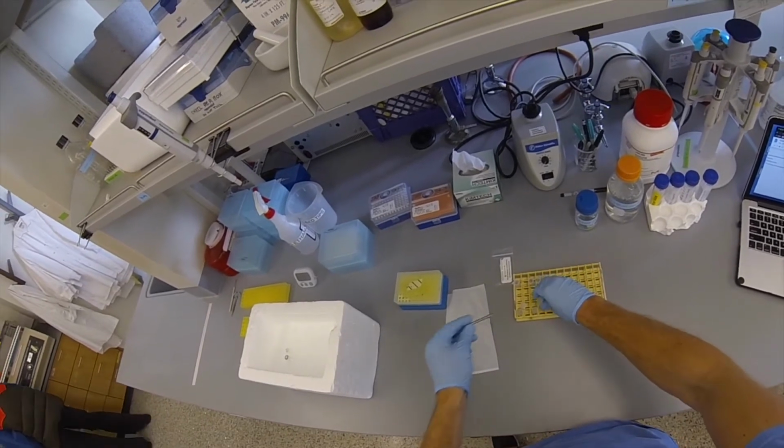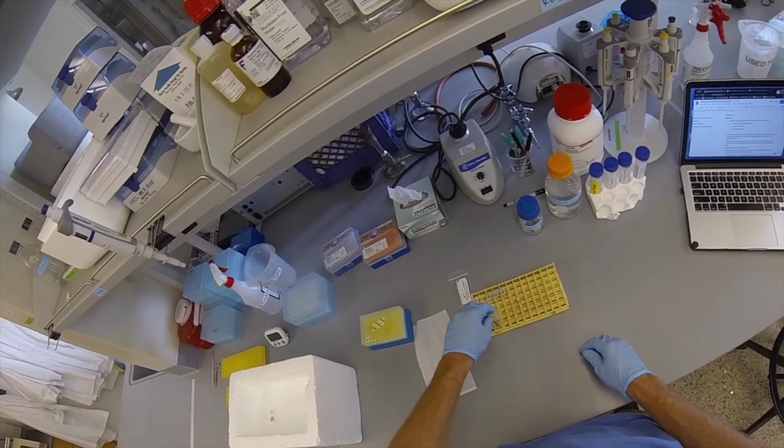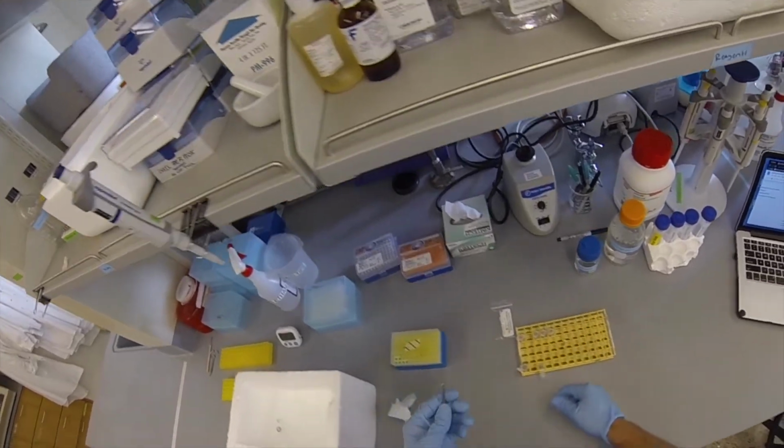Clean the tissue homogenizer in between each sample. Dip the tissue homogenizer in the water, give it some twists, and then move it to the ethanol, give it some twists, and wipe down before going into the next test tube.